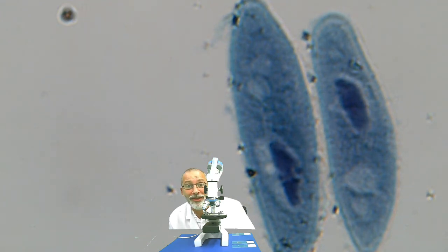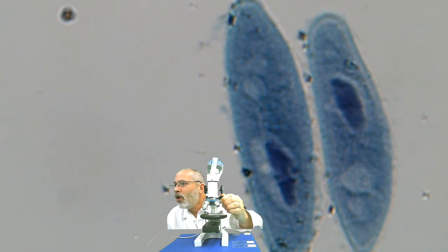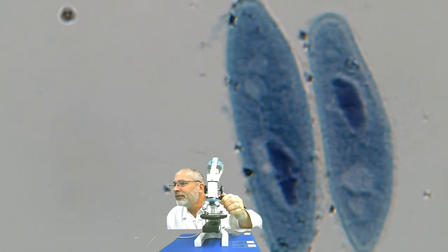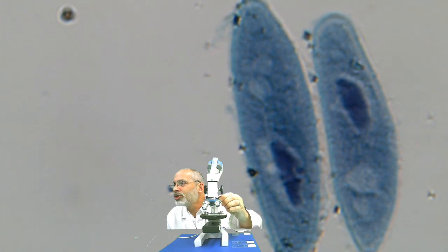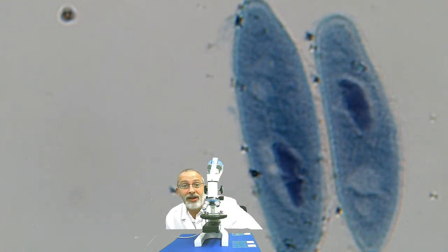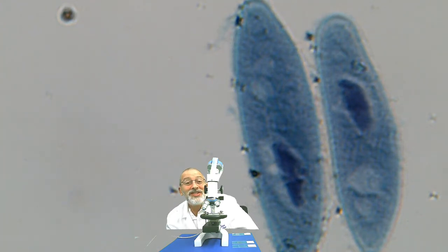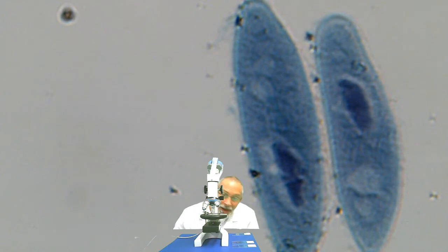It's like their mouth. It's how they eat. And although it's not all that distinguishable on these specimens, all around the Paramecium are tiny hair-like structures. Do you remember what these tiny hair-like structures are called? The cilia. All right, take a moment now and draw the Paramecium under 100 times magnification.